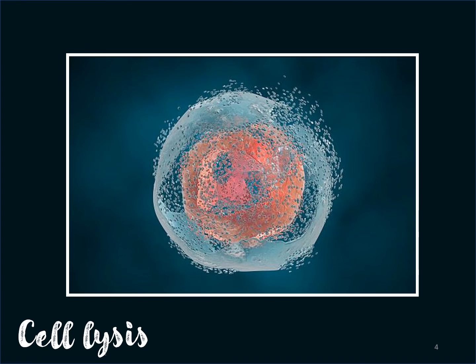So the first step of protein purification is cell lysis, and in this particular lecture we are going to be talking in detail about the different techniques of cell lysis, when to select which technique, and what the advantages and disadvantages of each of these techniques are. Now, why do you need to lyse a cell? Obviously, because your protein would be expressed by these living cells and you will have the protein in the cytoplasm of the cell. So in order to be able to purify the protein, you first have to lyse the cells.